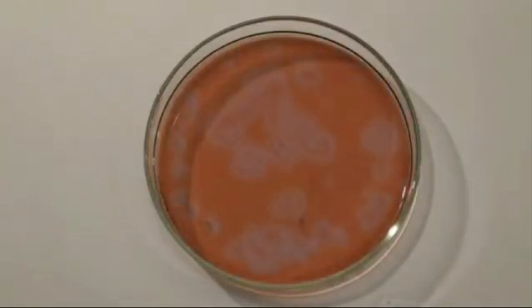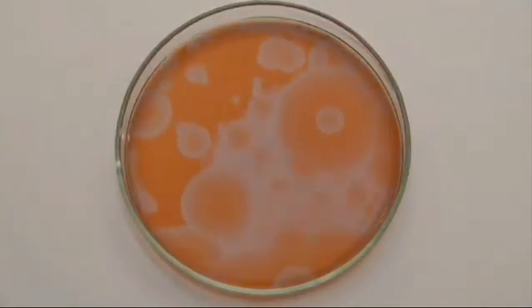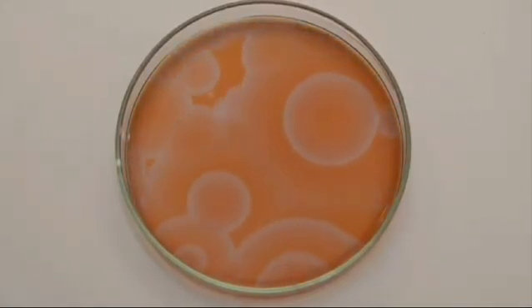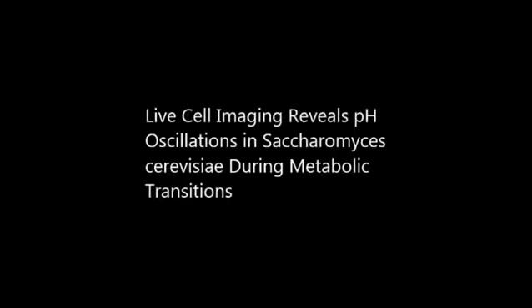With every run there are different patterns because of the many factors on the formation. In the following shot, the thickness of the layer was changed. Here clear images of the waves can be seen, which also prove that a thin layer gives a better effect.